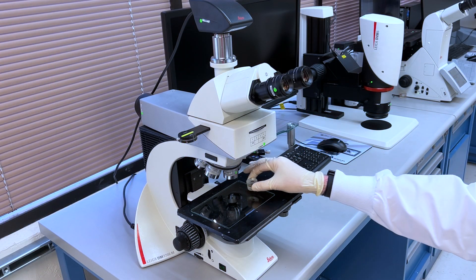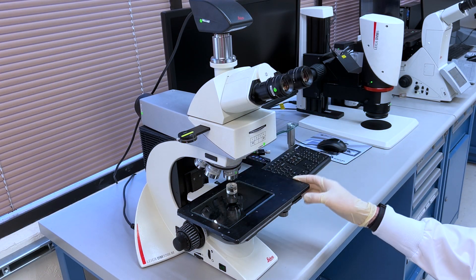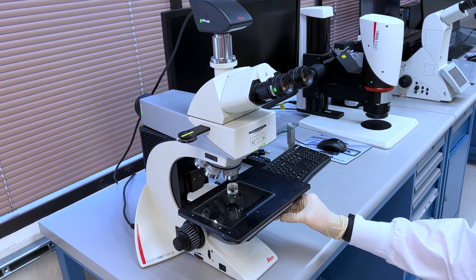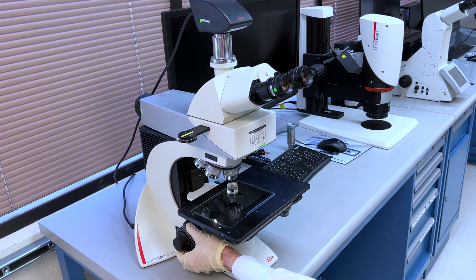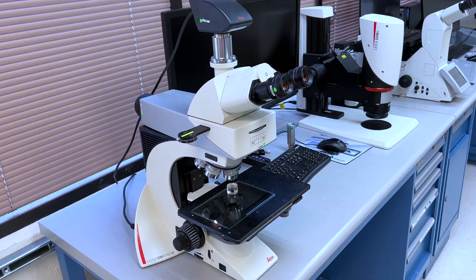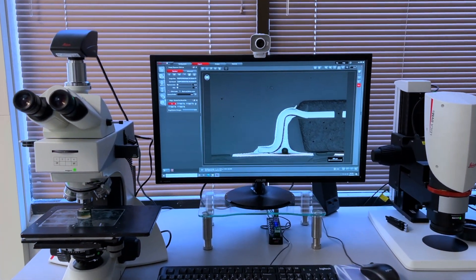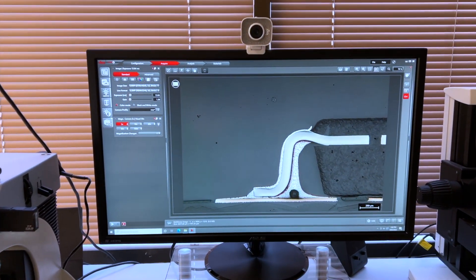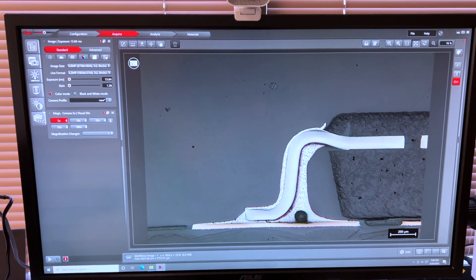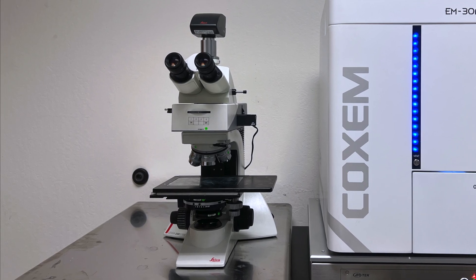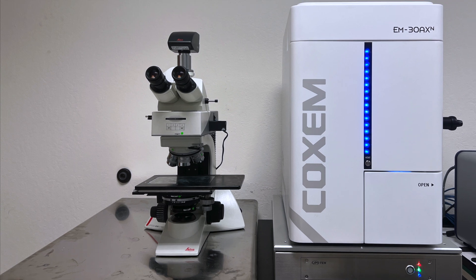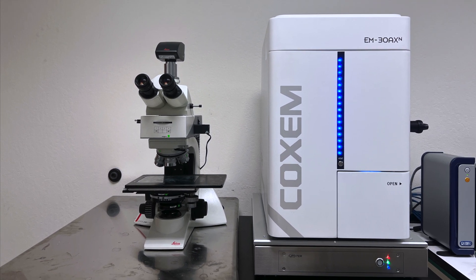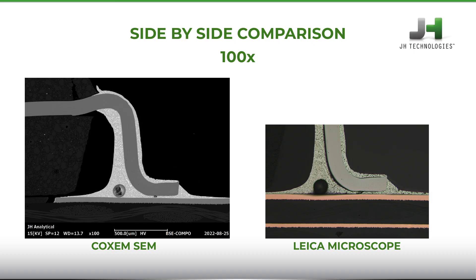Here we have the Leica DM2700M High Powered Materials Microscope. The system is configured with objectives allowing us to reach 1000x magnification, hardware and software capable of taking excellent images with varied lighting techniques. The system is configured with additional functionality to do grain analysis, measurement, annotation, and more. Here we compare the microscope images to those taken on the SEM at the same 100x magnification.